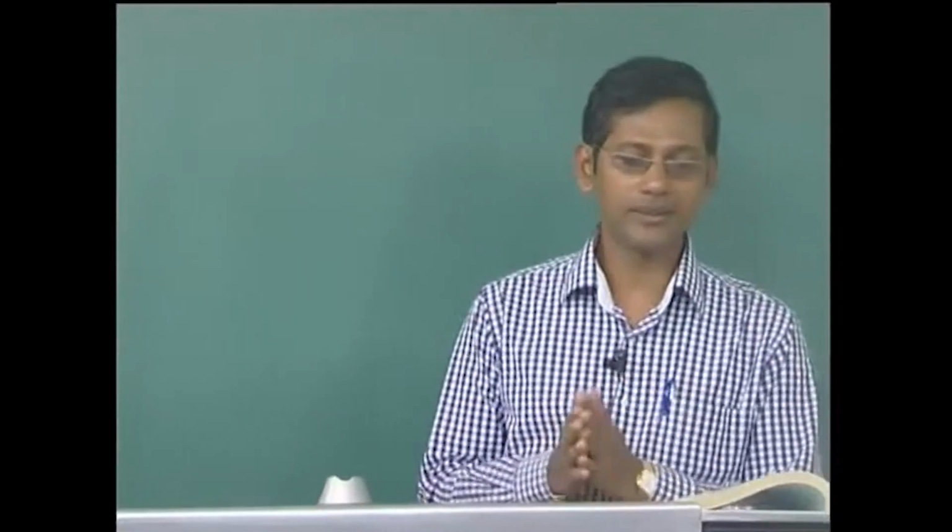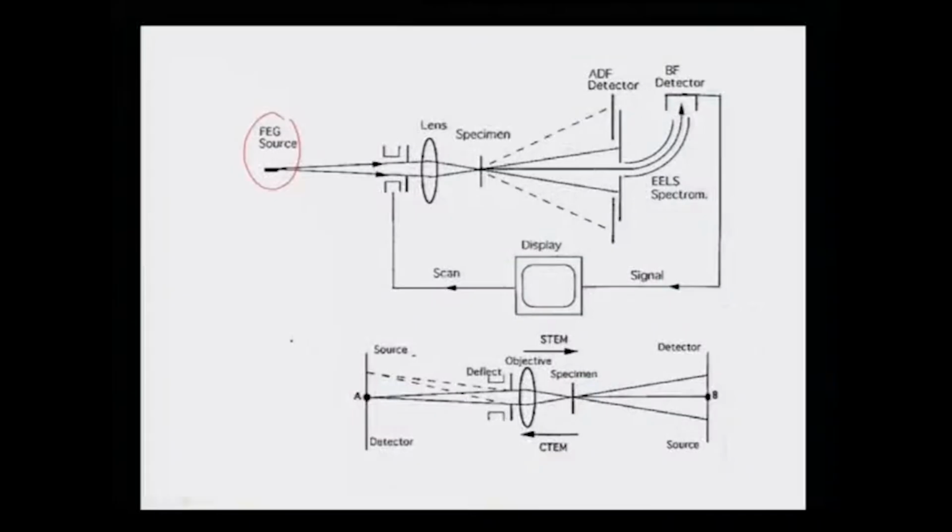Not only that, that is the biggest advantage. Another important advantage is that in a conventional electron microscope, the conventional TEM, normally a 2-dimensional detector such as photographic plates or a CCD camera is used to record the intensities at all image points in parallel, as the beam goes parallel and falls on the screen, the images are recorded. But in STEM, image information is produced in a serial form, like a time dependent voltage or current variation.